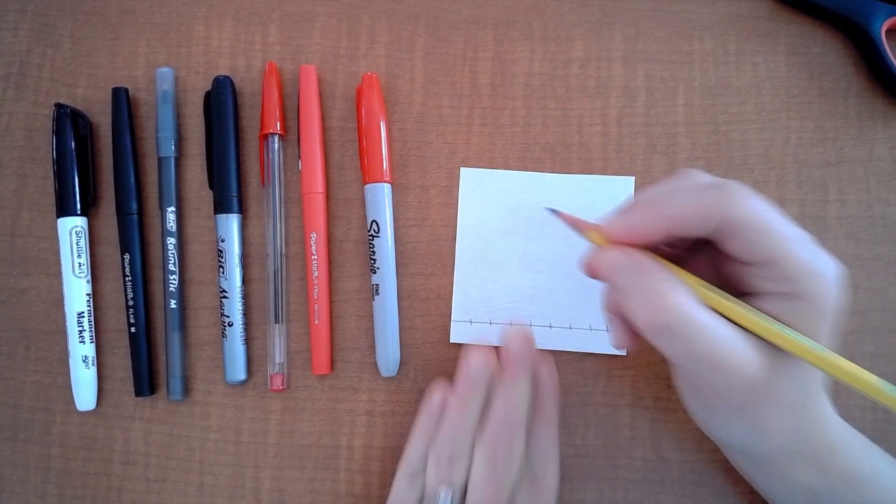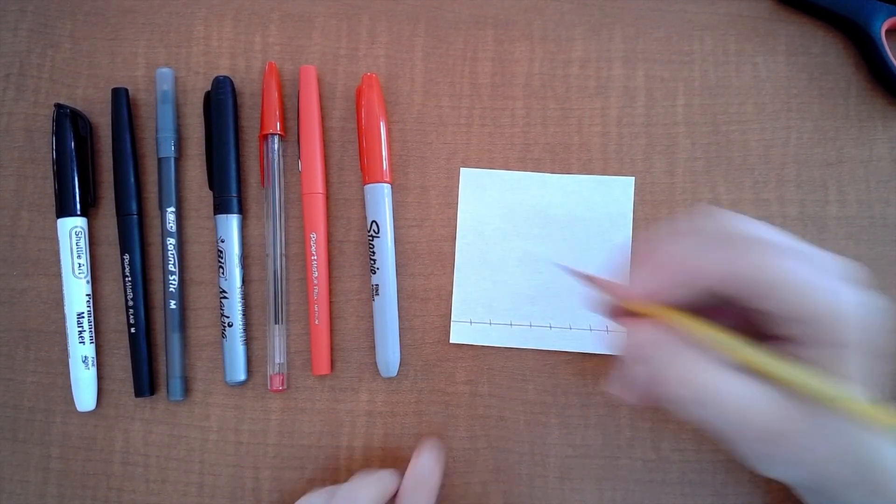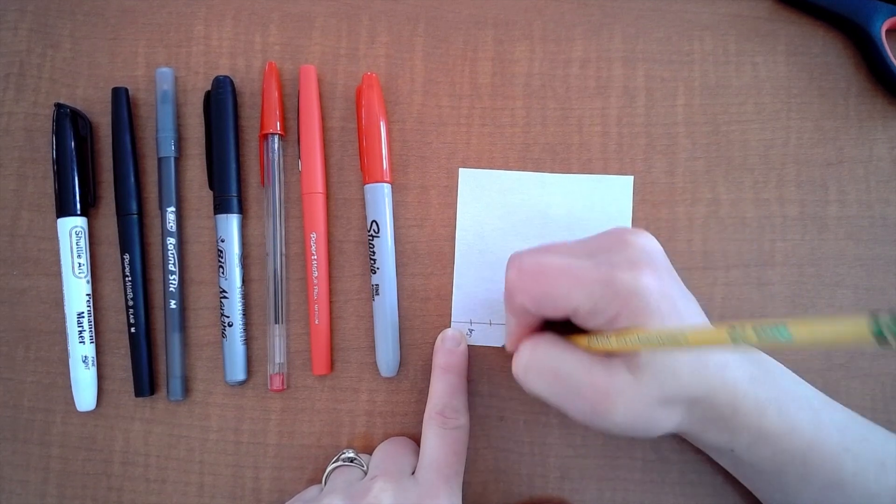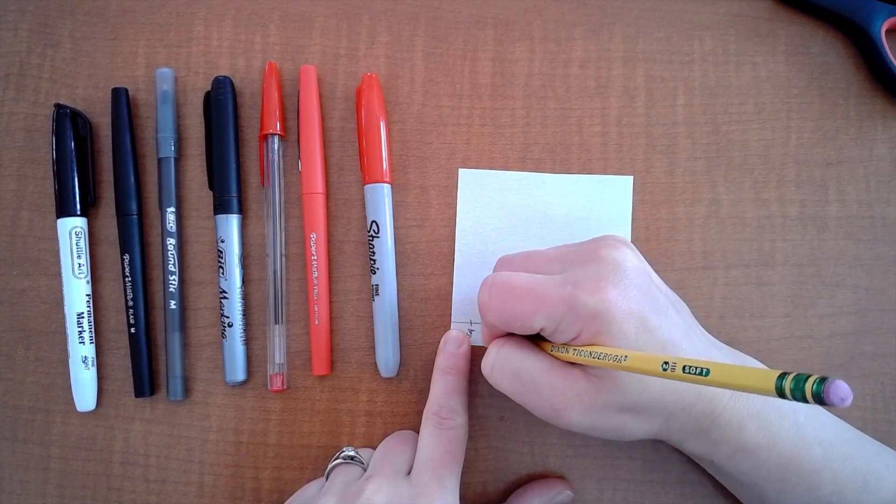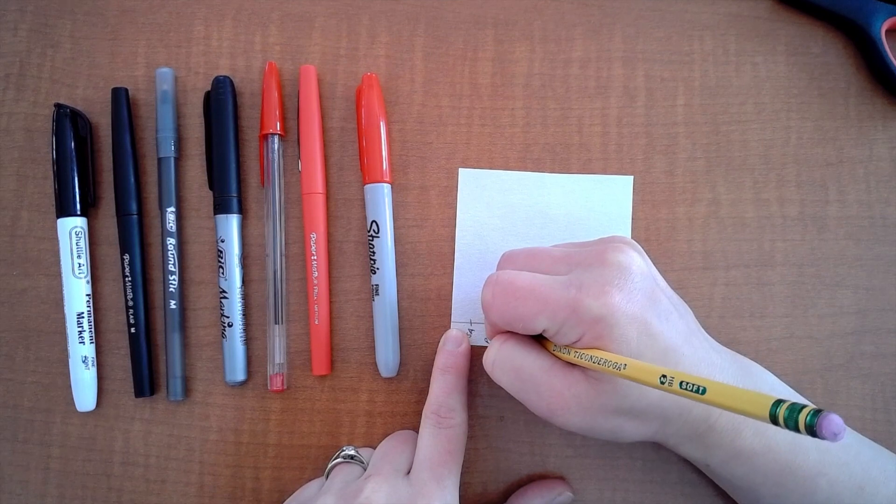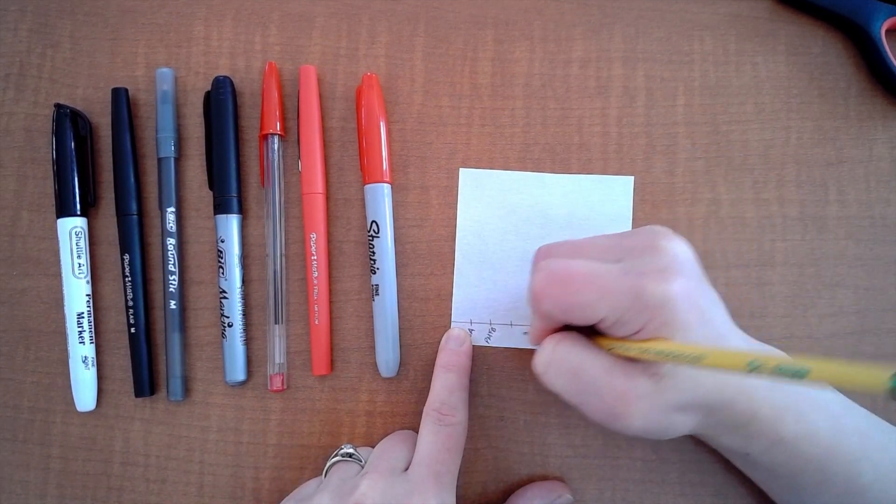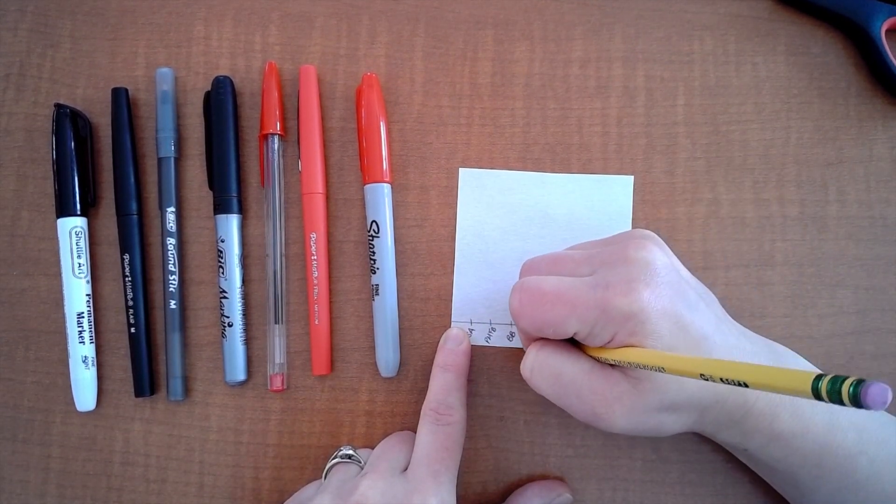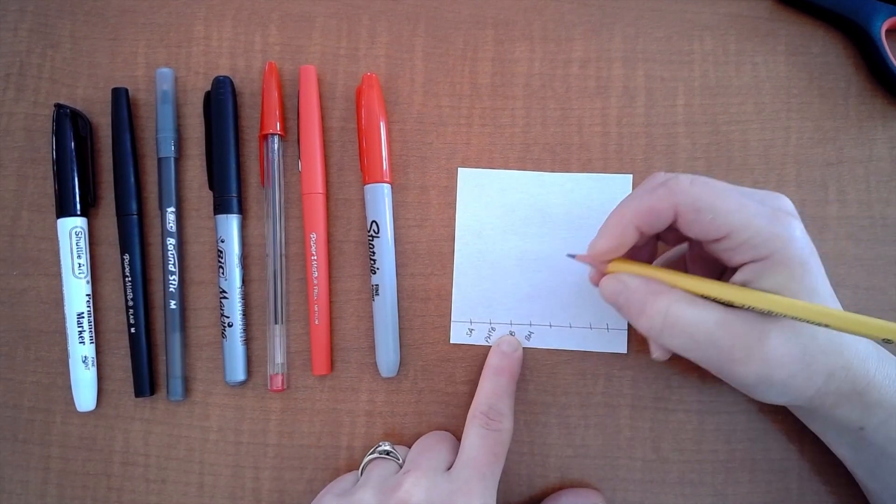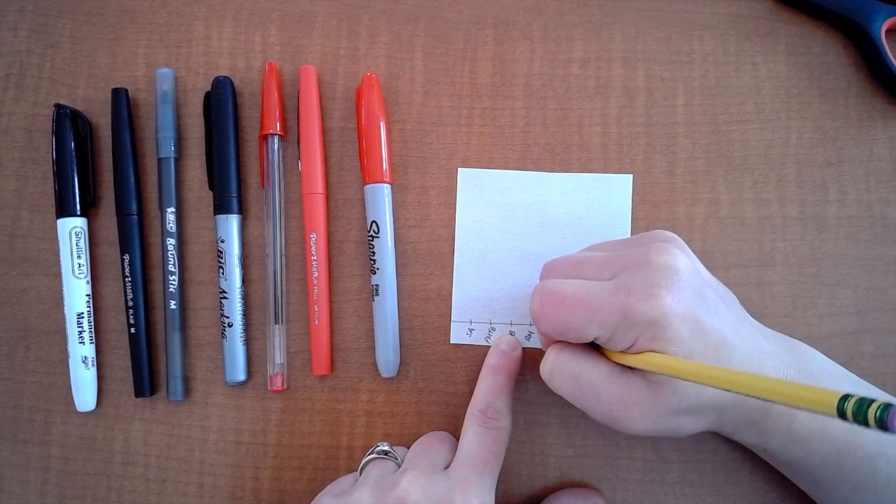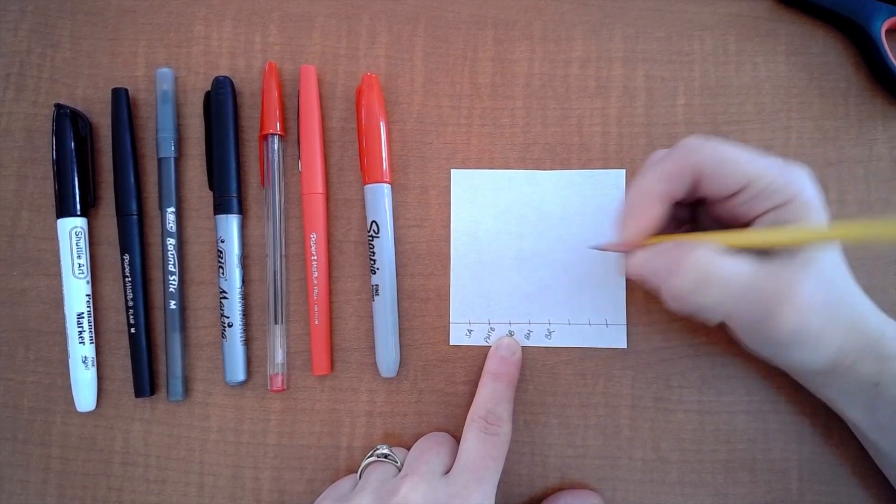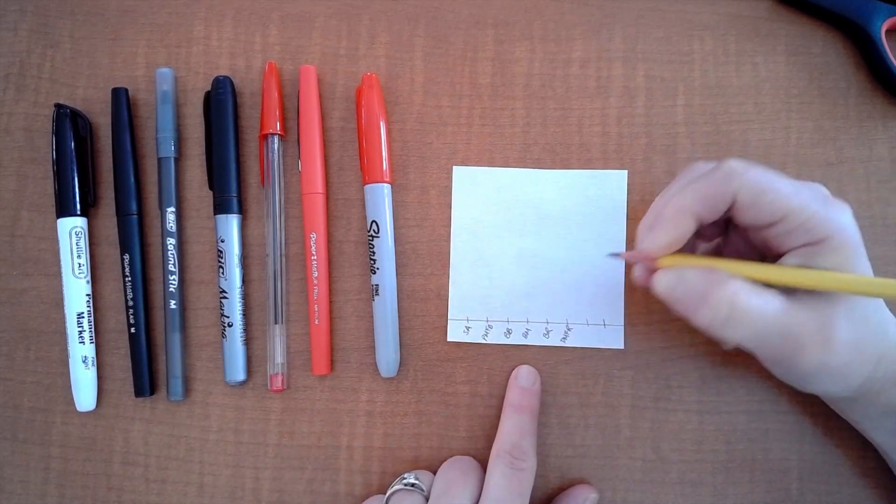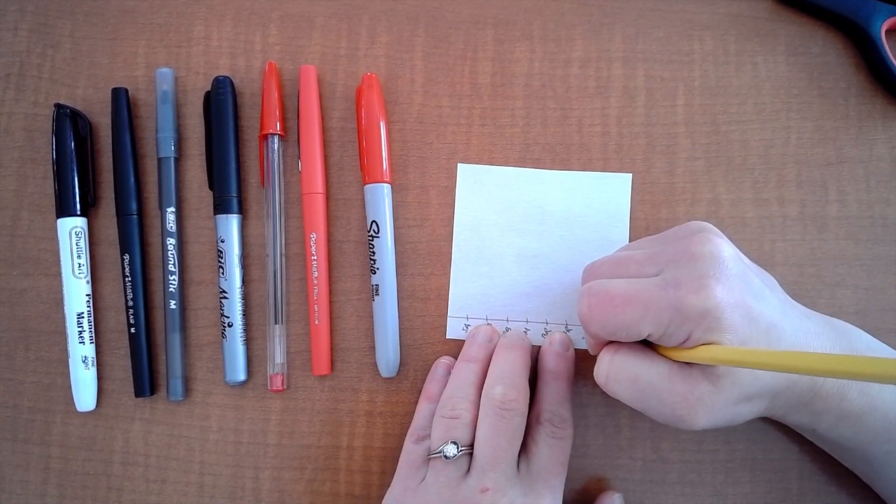So underneath each little mark I am going to write the abbreviation for the marker I am going to use so here we're going to do Shuttle Art so that will be SA and followed by Paper Mate Flair black so that's PMFB for that one and Bic round stick black so that's Bic black and Bic marking is BM.